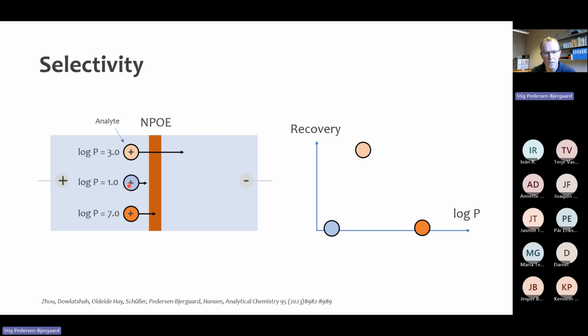And also, if we look at what happens to a very hydrophobic base, then this substance here will be extracted very fast into the liquid membrane, but it will remain there due to hydrophobicity and will not be extracted into the acceptor solution. So if we plot the recovery of these three compounds as a function of their log P values, we get a diagram like this.